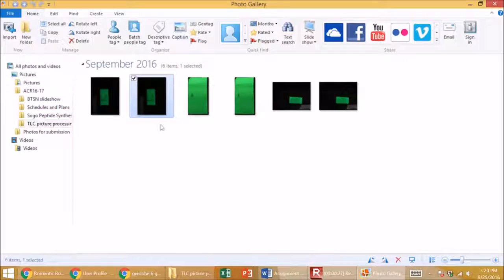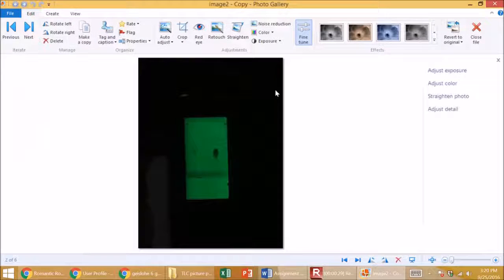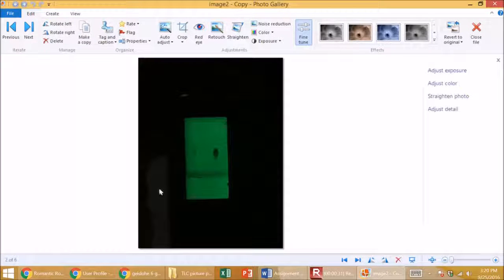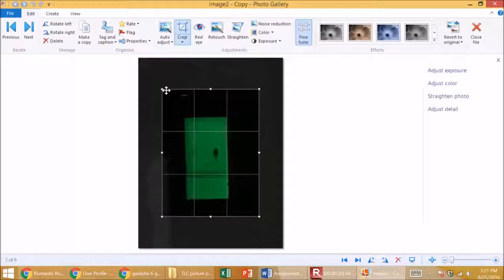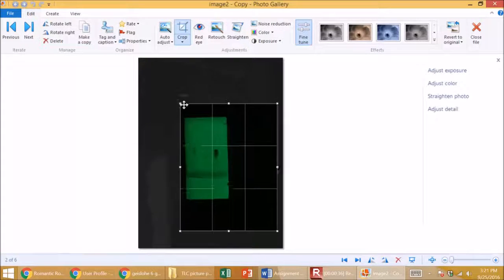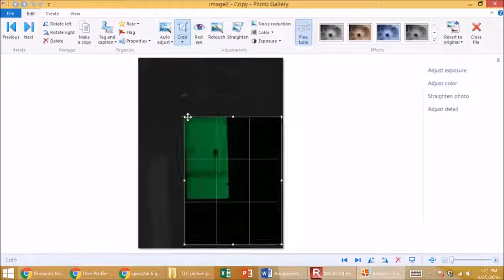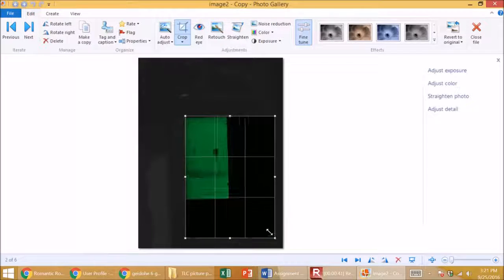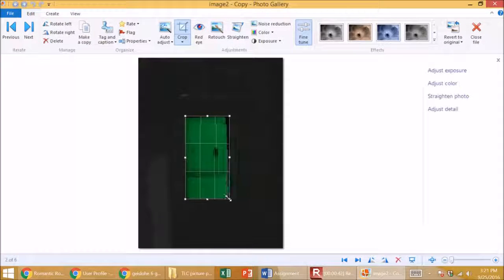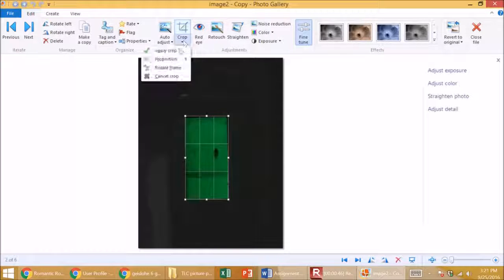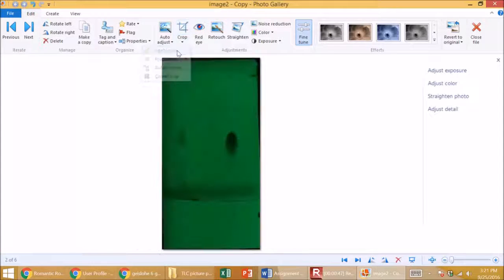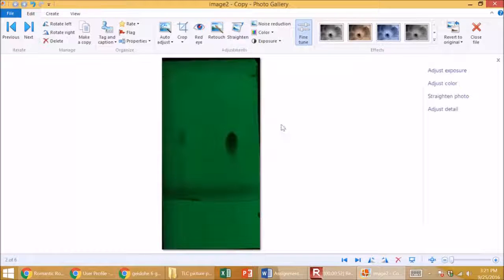The first thing I want to do is crop. There's way too much black here, so I'll crop it. All I want really is the TLC plate itself, not all the black. So there we go, I've set my outlines and I crop it. Now I've gotten rid of most of the junk. This TLC plate is upside down.